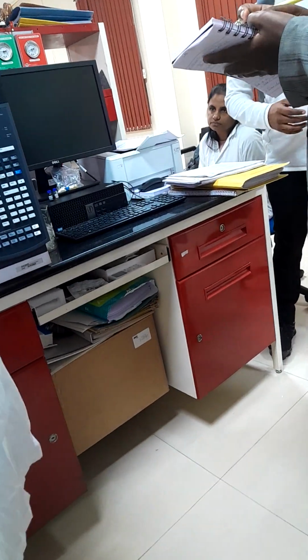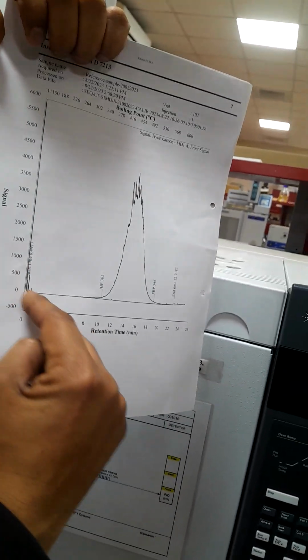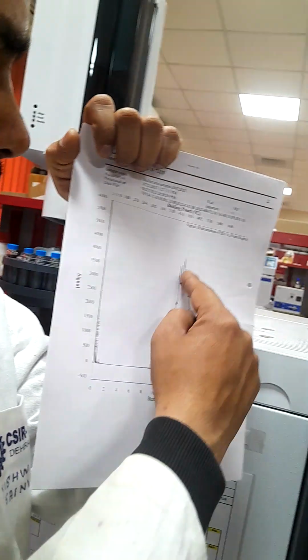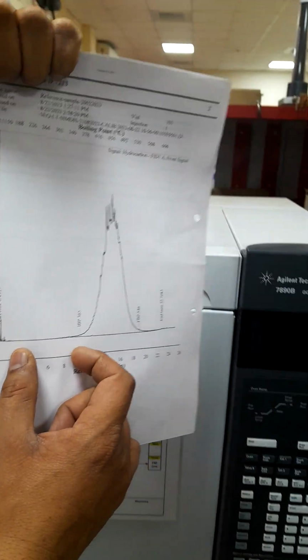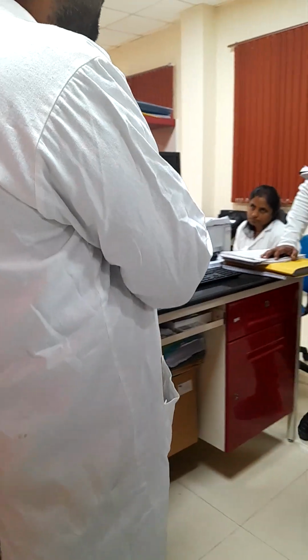As you see here, this is a sample data. Starting from here, it will end here. What it shows is that the sample elution will start, IBP at 365, and rise here, and then FBP. So how will this GC detect IBP and FBP?